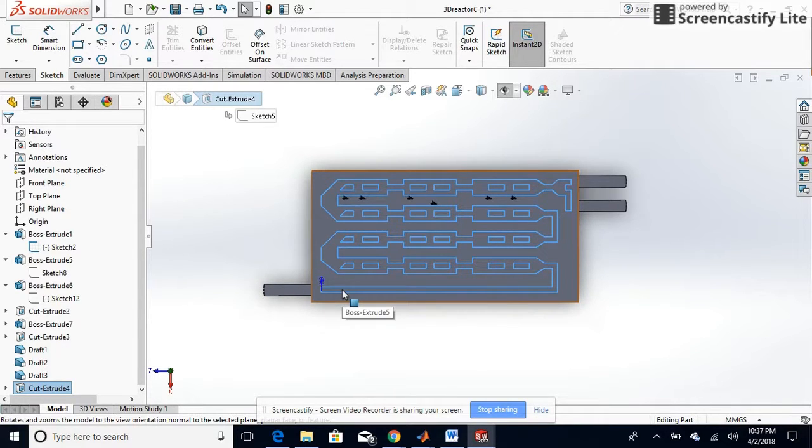We decided to go with as many baffles and narrowing and expanding channels to improve mixing. And in terms of our other reactors, it seems to have done that. We also sloped some edges. We noticed that in one reactor there were a lot of bubbles forming in the sharp edges, like here.